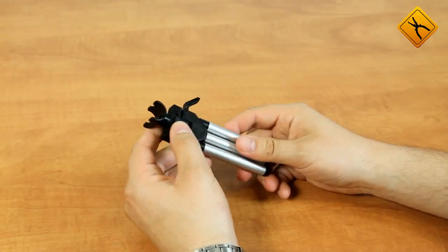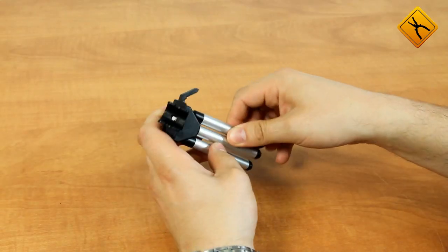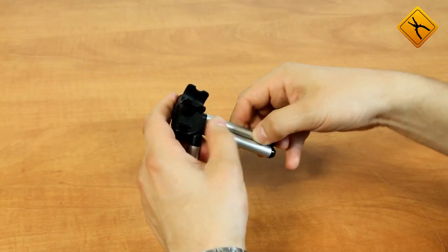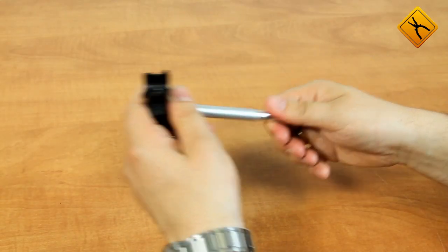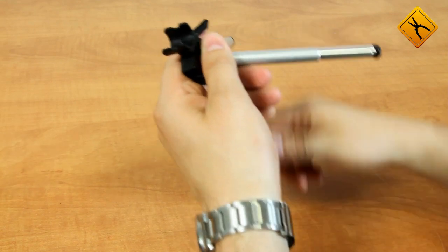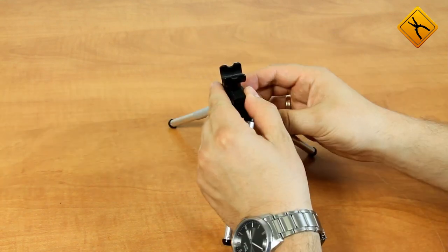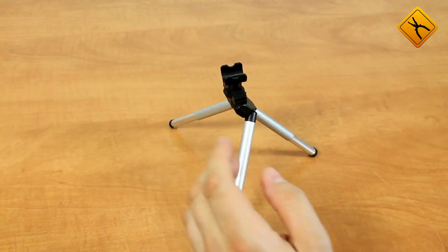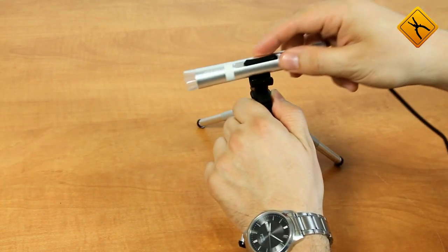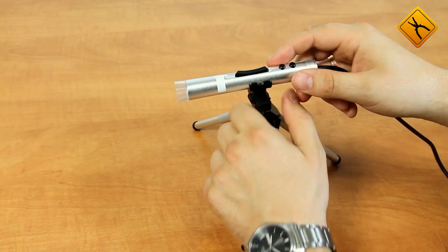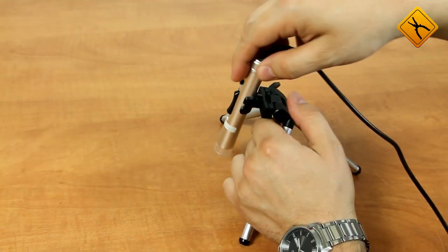The tripod is quite compact and can be adjusted in many different ways. The microscope can be placed at an angle towards the examined object or just above it.